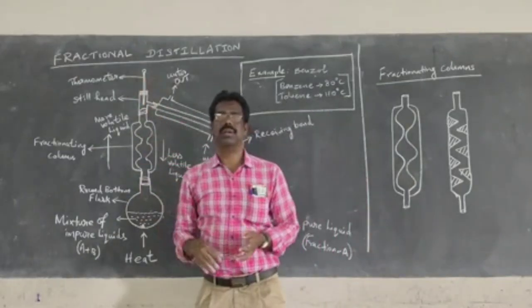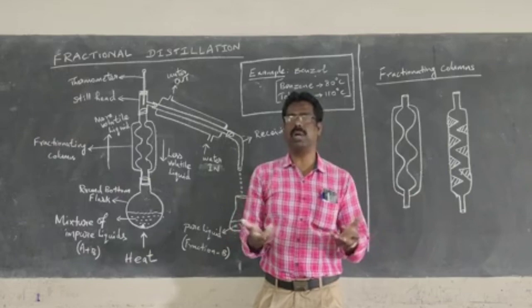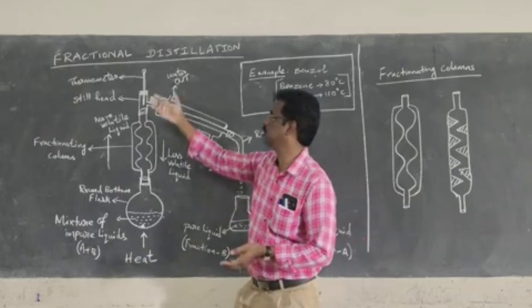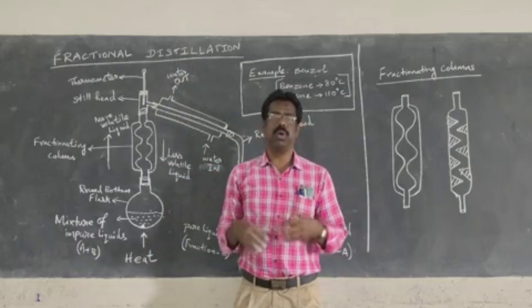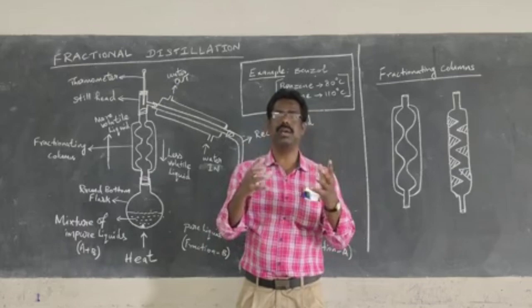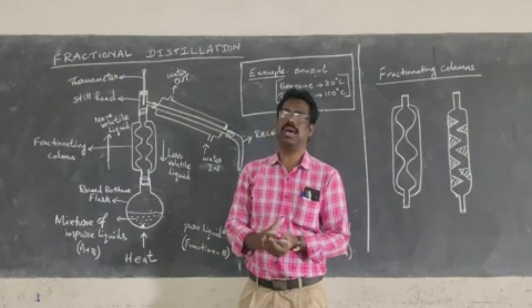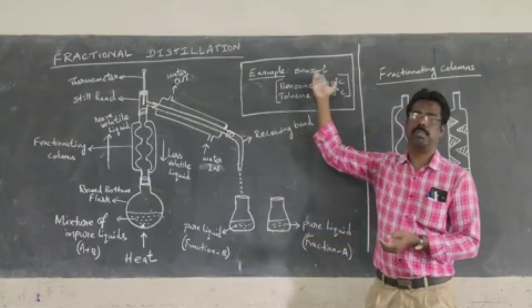And fraction is nothing but more than one component. Fraction means more than one component is present in the liquid. So this fractional distillation technique is used for purifying more than one liquid present as a mixture in an impure liquid. Here we can consider benzol as an example.